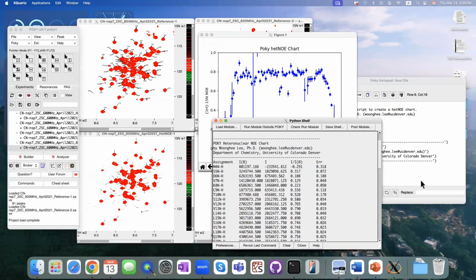So that is it. This is the end of the tutorial for performing NMR relaxation via POKY Notepad scripts. If you want to learn about doing relaxation through the peak height analysis dialog and perturbation plot dialog in the POKY suite, please feel free to check out that video.